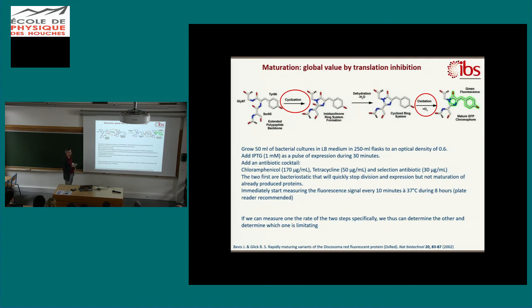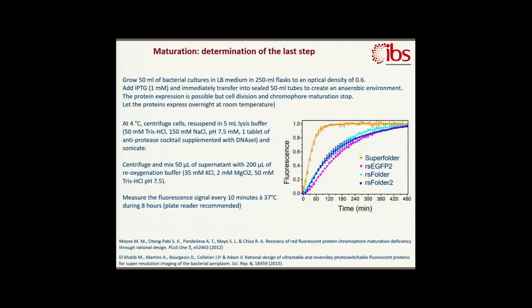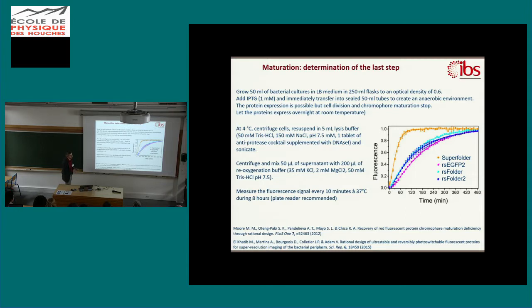then we can distinguish the other, and that's what you can do by measuring the last step, so the oxidation step at least. Again, by growing 50 milliliter of bacteria in 250 milliliter flasks, add IPTG, but this time you transfer all that immediately in a Falcon tube of 50 milliliter.